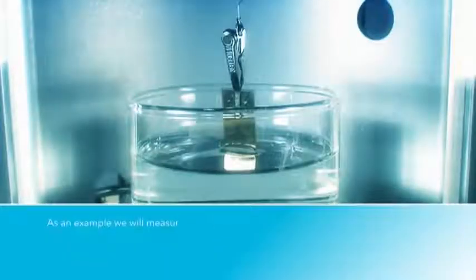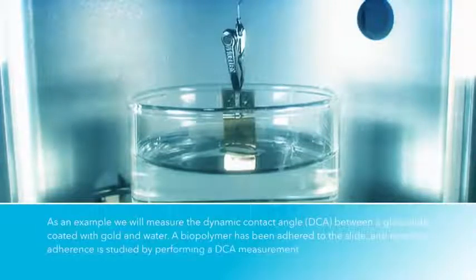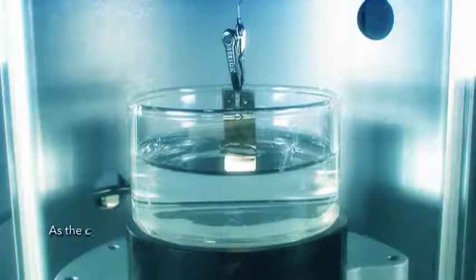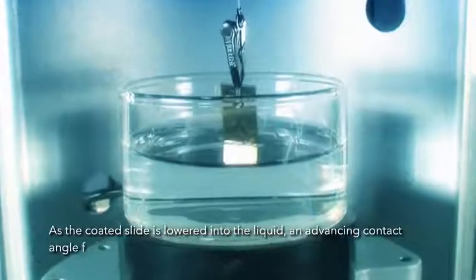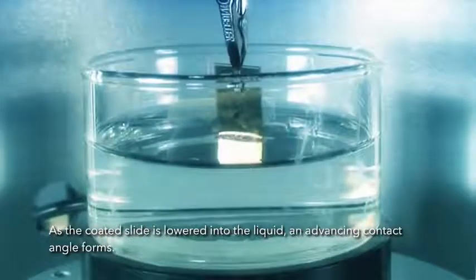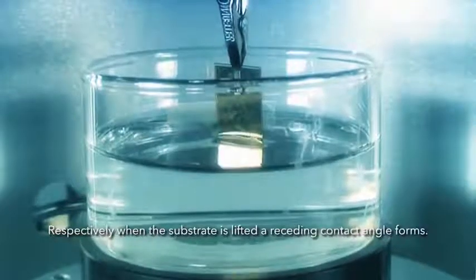As an example, we will measure the dynamic contact angle between a glass slide coated with gold and water. A biopolymer has been attached to the slide, and now the attachment is studied by performing dynamic contact angle measurements. As the coated slide is lowered into the liquid, an advancing contact angle forms. And when the substrate is lifted, a receding contact angle forms.